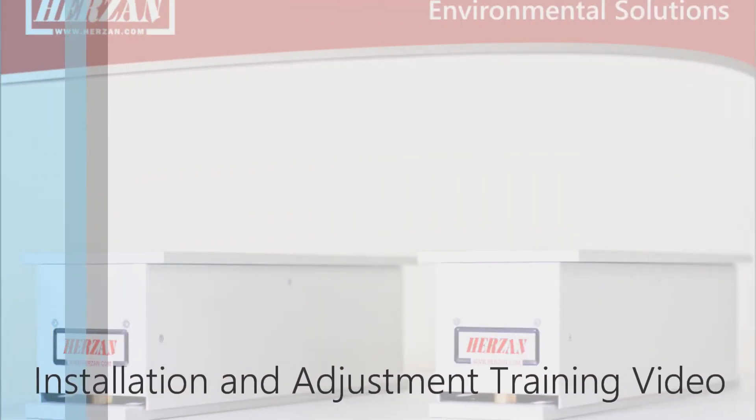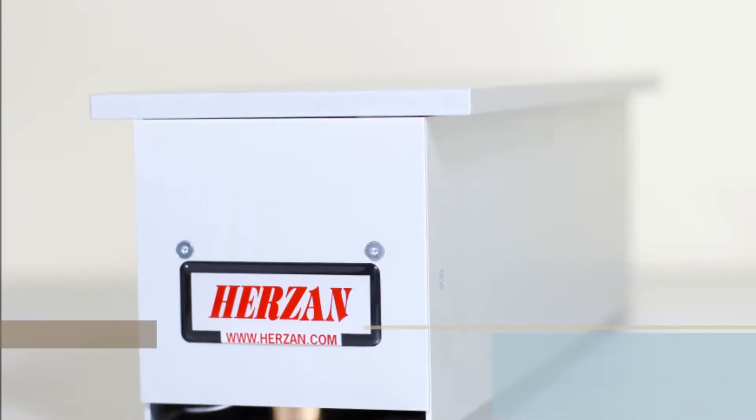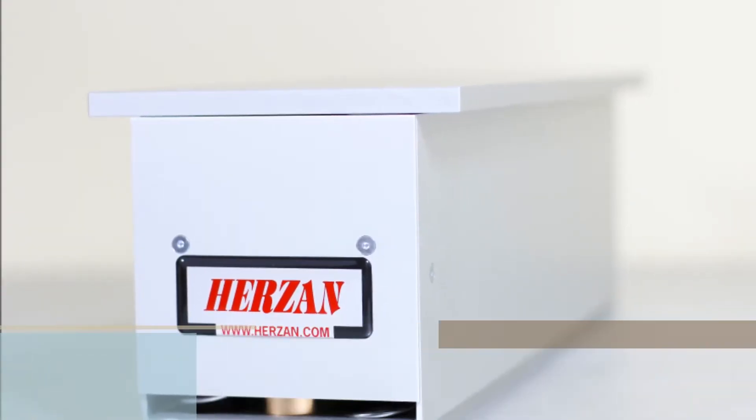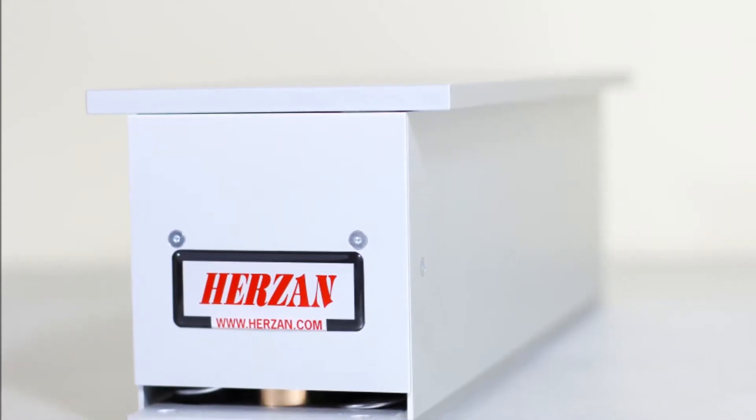Welcome to the AVI series installation and adjustment training video. The AVI series is an easy to install, no maintenance solution for instruments and applications requiring low frequency, active vibration isolation.